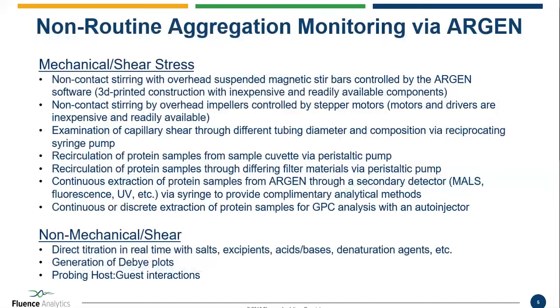We've also looked at capillary shear stress through different tubings and tubing diameters. We've done that by using a reciprocating syringe pump to recirculate sample in and out of the ARGEN cell while monitoring in real time.